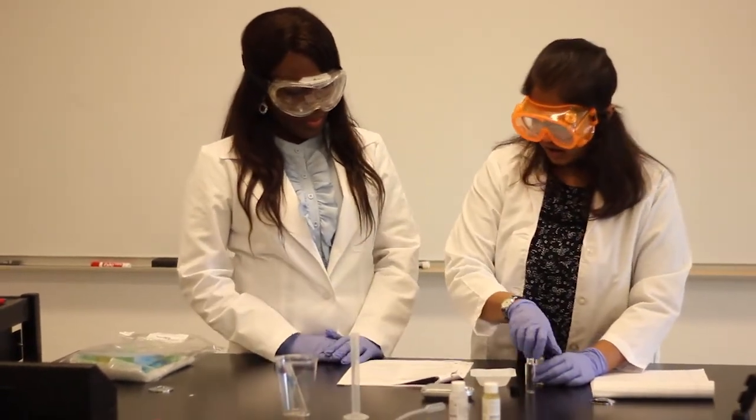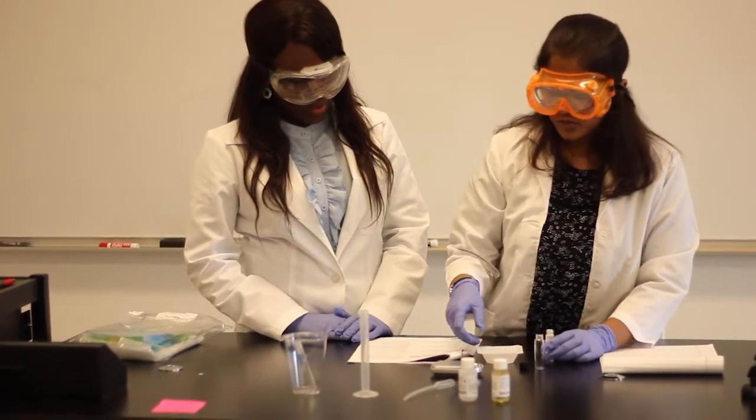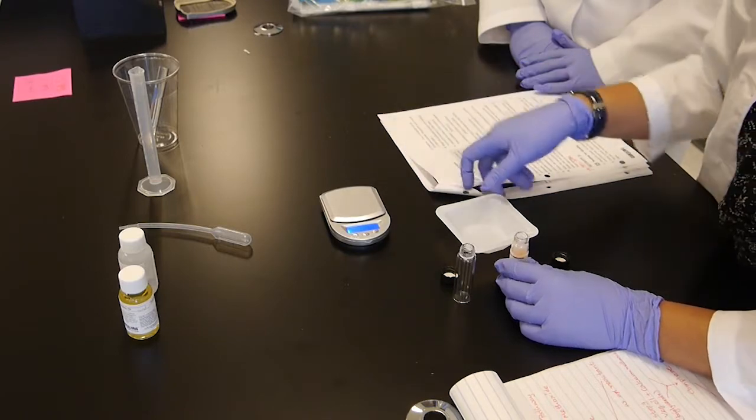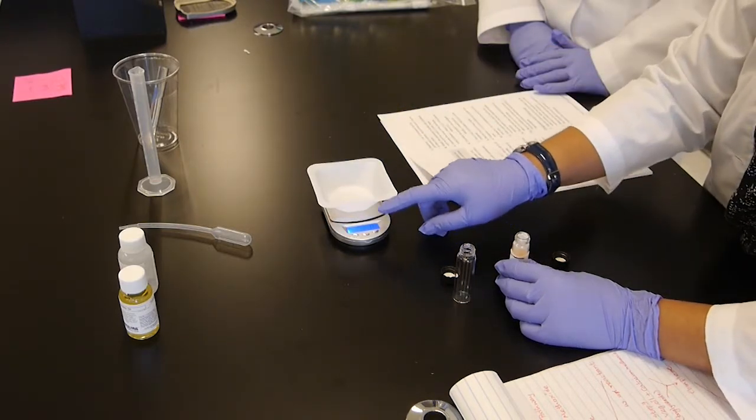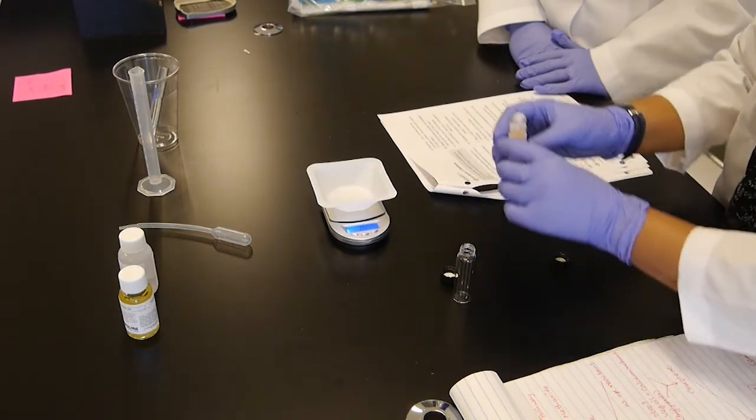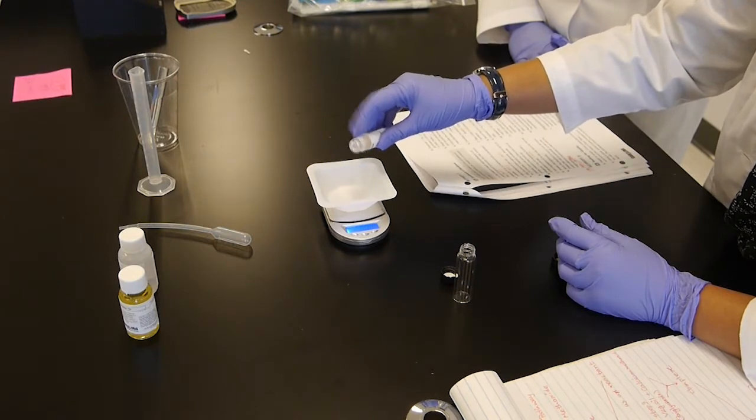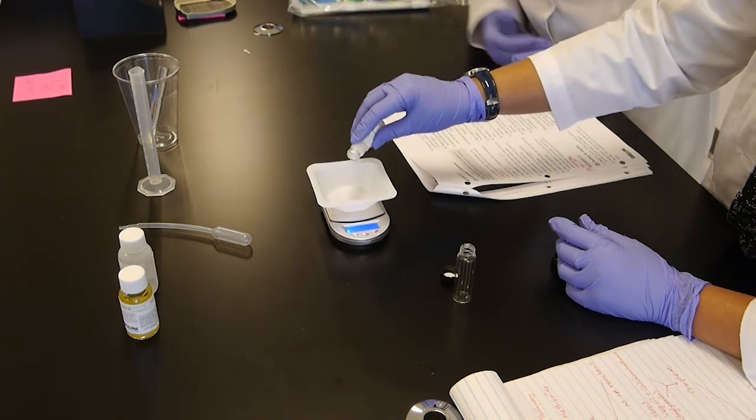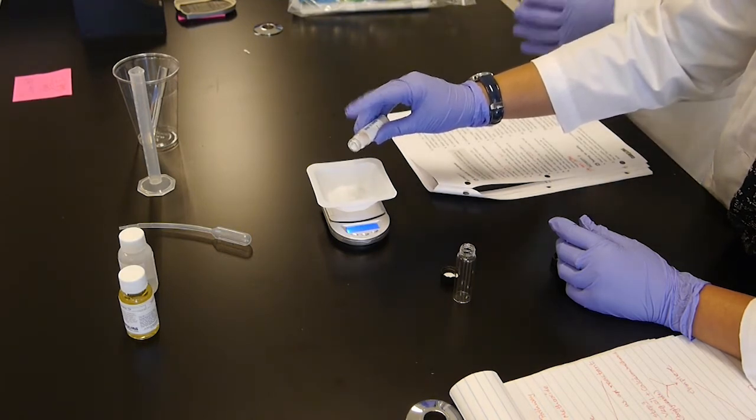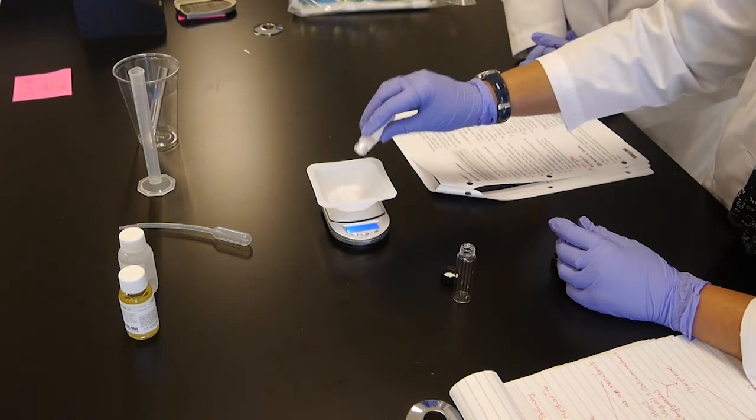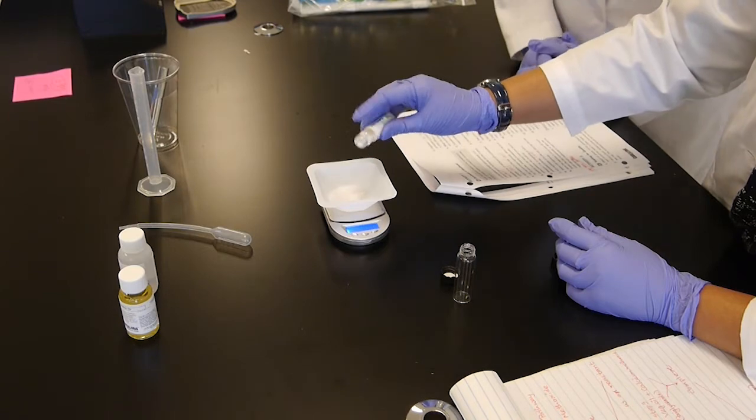So first of all, we're going to weigh out about 0.02 grams of calcium hydroxide in the weighing balance. So let's put the weighing pan right here. Tare it. And I'm going to try to take about 0.02 grams. The purpose of taring is to make sure that you're negating the mass of the weighing boat. And since we weren't provided with a spatula, we have to use this method to transfer the calcium hydroxide into the dram vial.